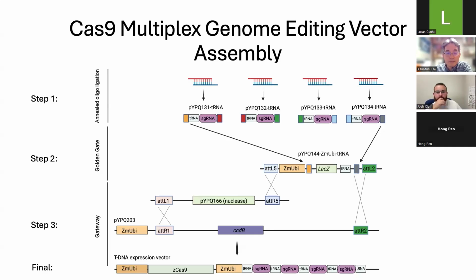So in this system, each gRNA is first cloned into a backbone before a different backbone. To explain, the system I was using was exactly a system like the one developed in Voytas's lab, the Cermak 2017 article, and in this system, each gRNA, the overlaps for the Golden Gate are in the middle of each gRNA between bases 8 and 12, if that makes any sense.